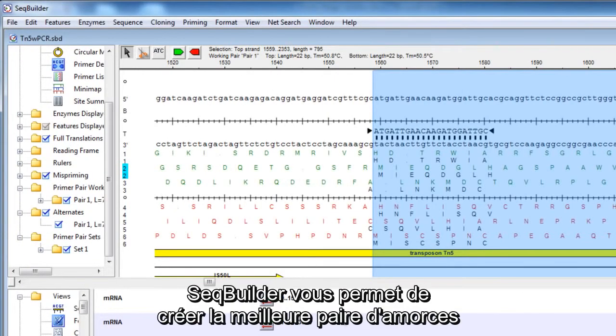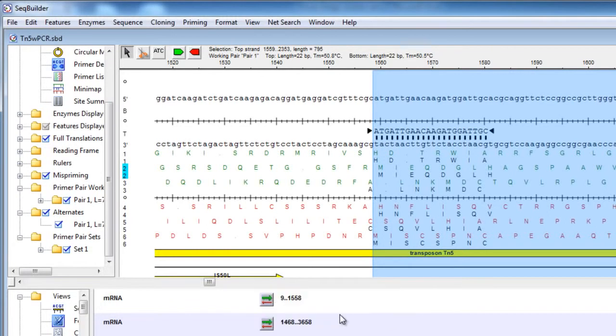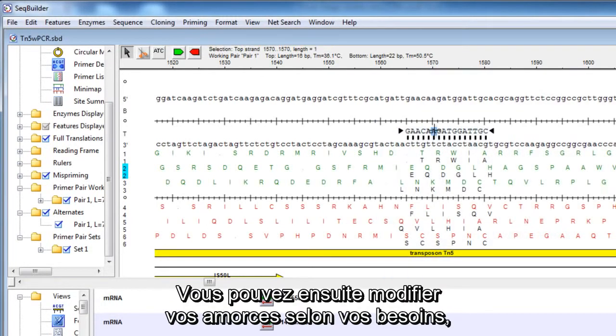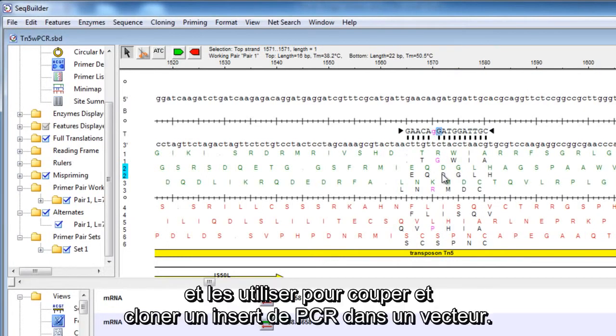SeqBuilder will create the best primer pair and display it in the primer design view. You can then modify your primers as desired, and later use them to cut and clone PCR insert into a vector.